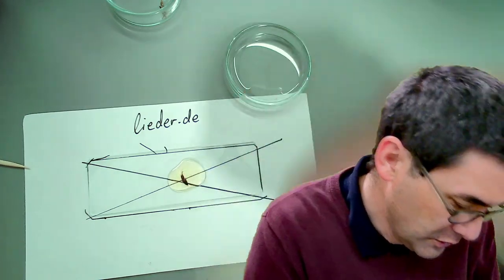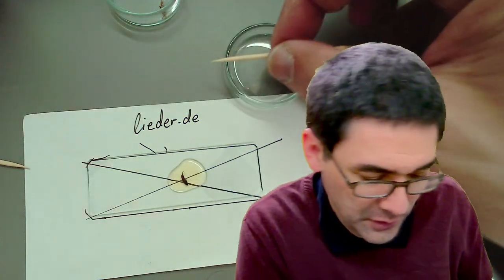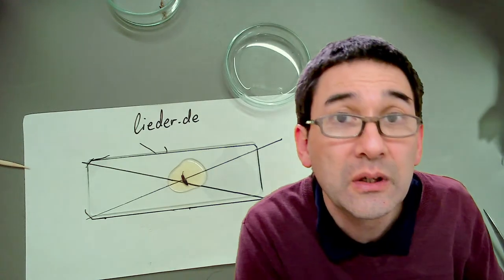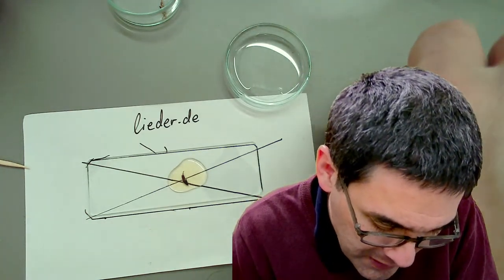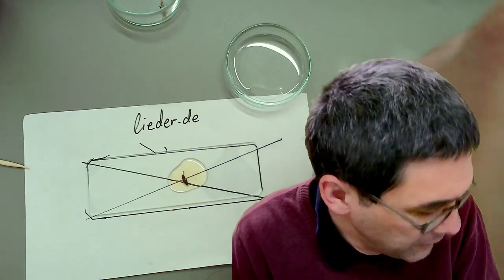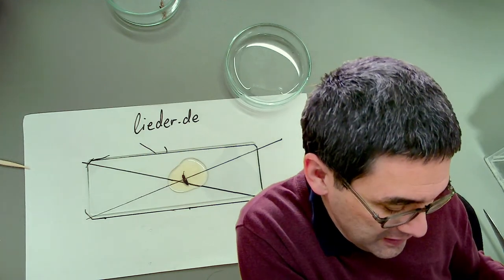Because again, the reason is because I would like to know to what extent this mounting medium is able to clear the object and to make it more transparent. And then, folks, I'm going to call it quits for this week, for today.